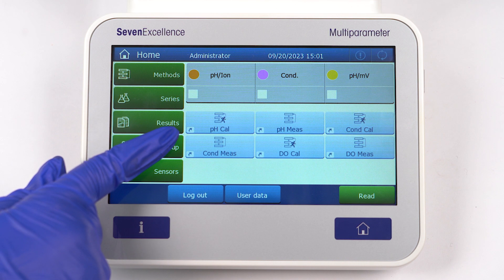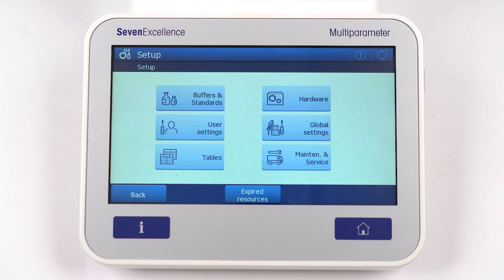Next in the line is the Setup menu. In this menu, you'll find all the standards and buffer groups, user settings, tables, hardware, global settings, maintenance, and service.